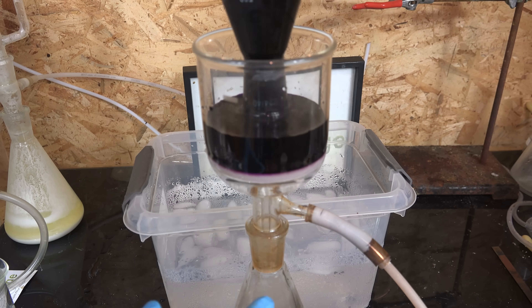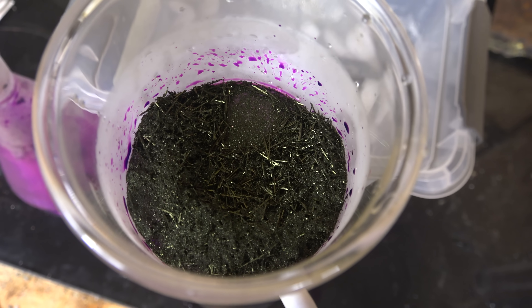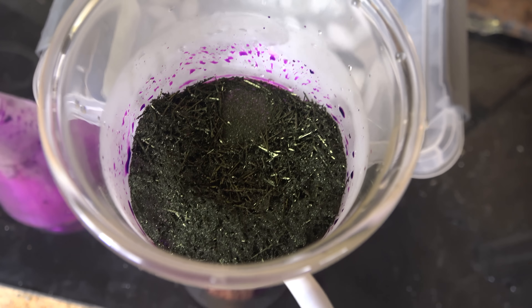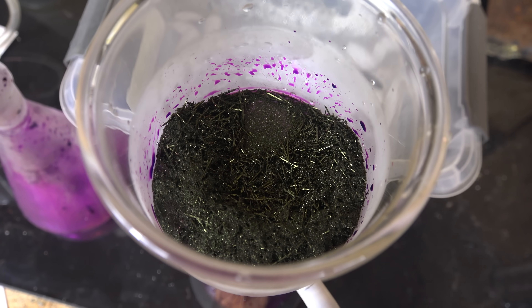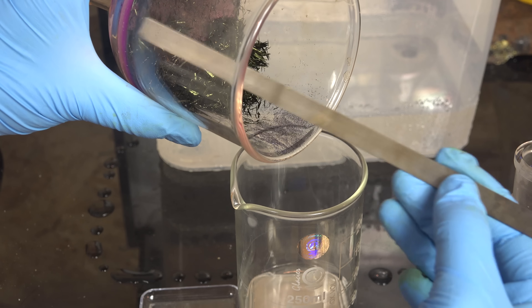Then we suction filter again to recover the crystals — and that is beautiful. Potassium permanganate crystals are black needles, which makes them quite a sight compared to all the white powders we chemists usually deal with. I'm going to continue drying under vacuum for an hour to thoroughly dry them before transferring to a beaker and taking the mass.